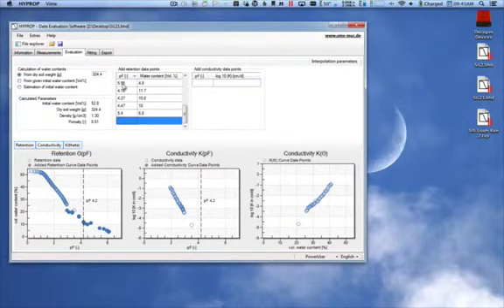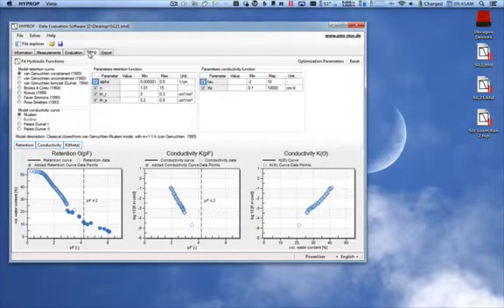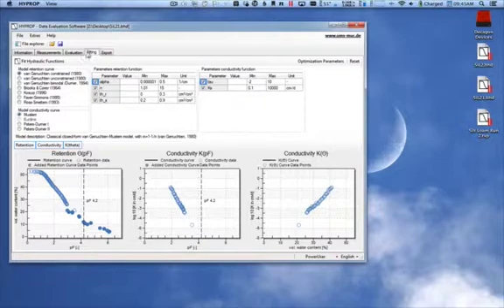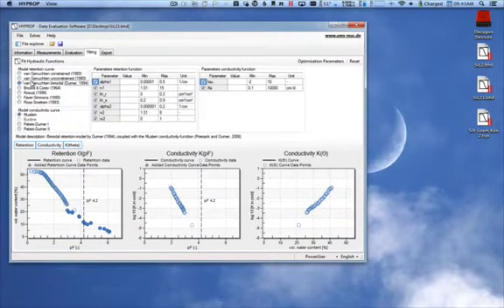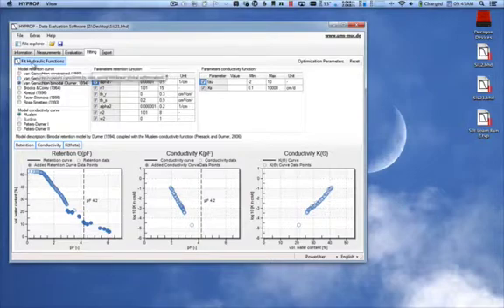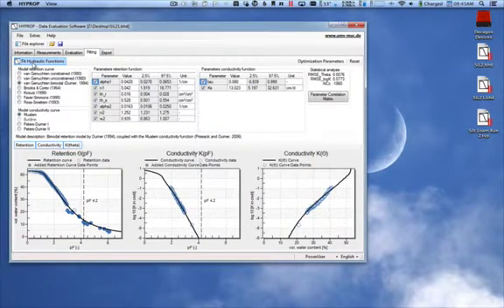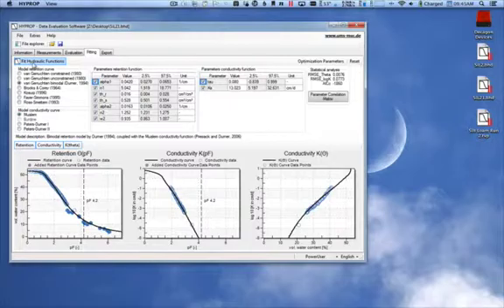Once we've completed entering our WP4C data, we can now go to the Fitting tab. In the Fitting tab, we can fit different hydrologic models to go along with our soil moisture release curve data. Select the model you want and hit the Fit Hydraulic Functions button.